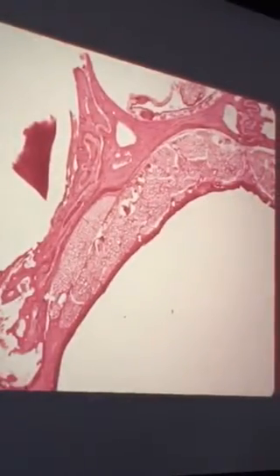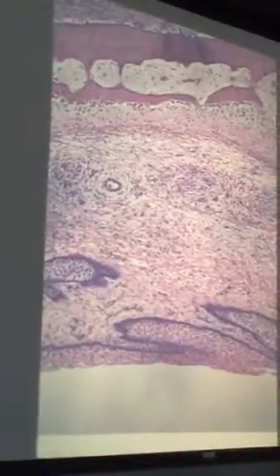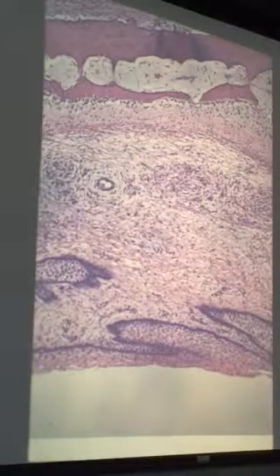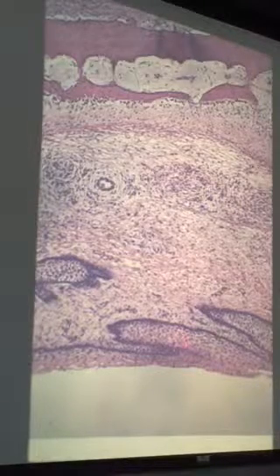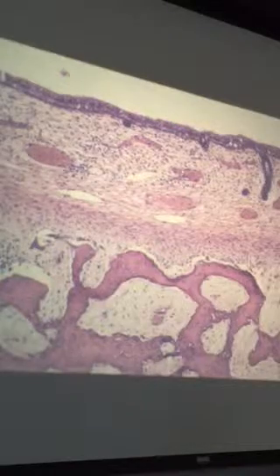Okay, and this shows that minor salivary gland a little bit better. And in this case, we do have a submucosa there because it's being occupied by that minor salivary gland. Okay, and this is one of the ones that we find in the slide boxes, and unfortunately this one has come from a developing individual, and so we see an epithelium here that has not yet become keratinized. But if we look at the upper surface of that same organ, what do we have right there? Respiratory epithelium.